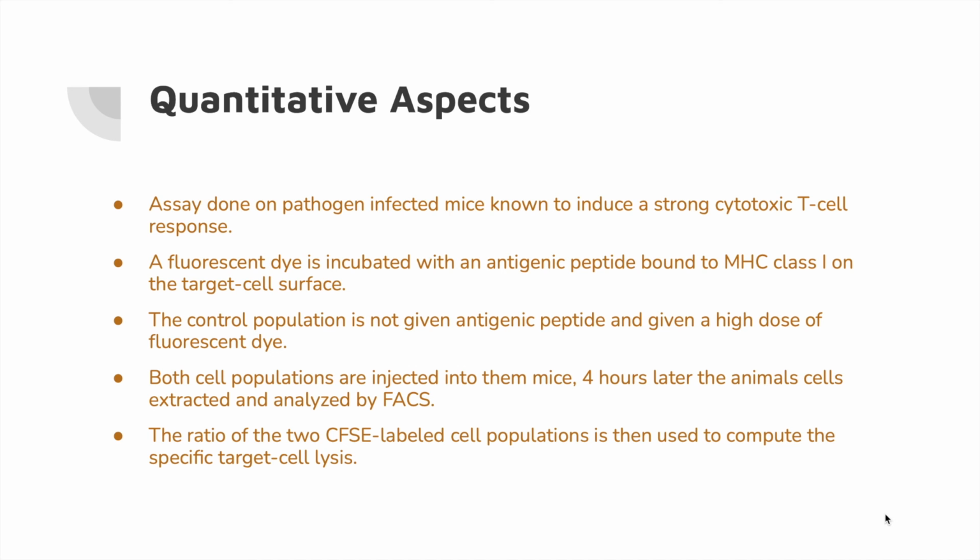All of these quantitative aspects quantify the number of cytotoxic T cells in order to provide an analysis of the effects that are being carried out on the immune system.